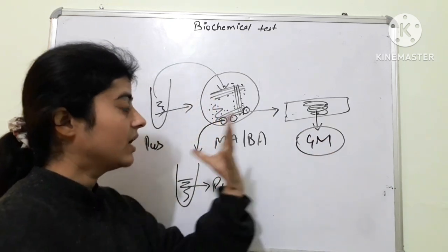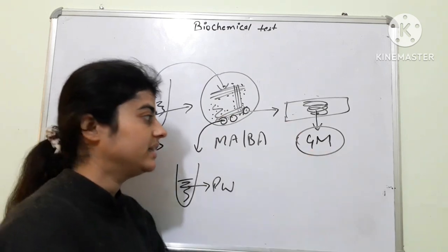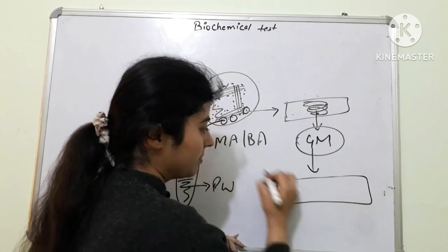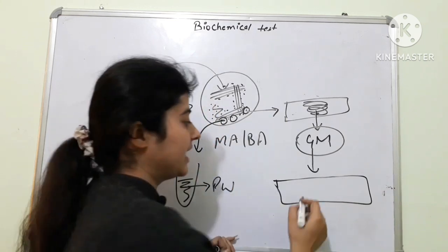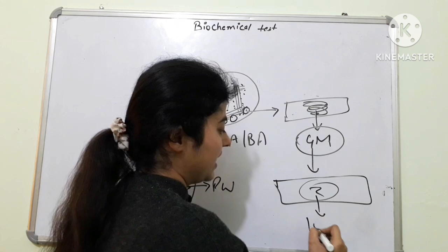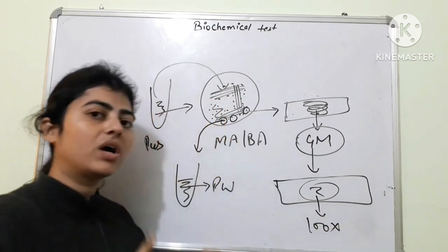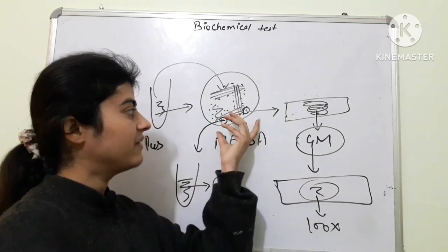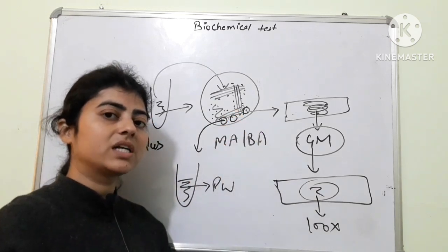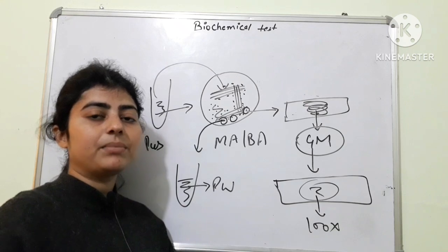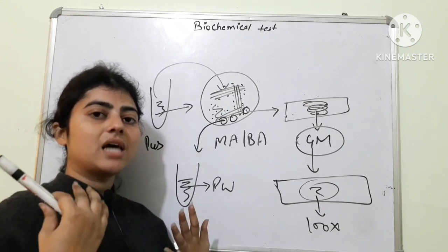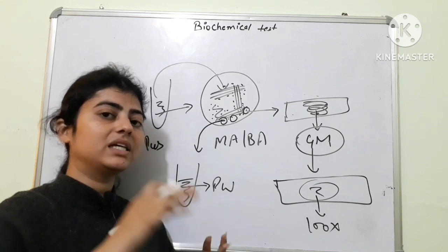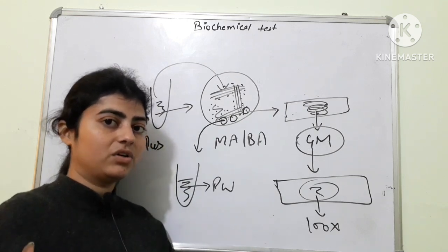After preparing and drying the smear, we will perform gram staining. Once done, we will take this slide under the microscope and perform microscopy at the 100x lens — the oil immersion lens — and identify whether the bacteria taken from the petri plate is gram positive or gram negative. If it is gram positive then we follow some different biochemical tests. If it is gram negative then there are different biochemical tests for gram negative.